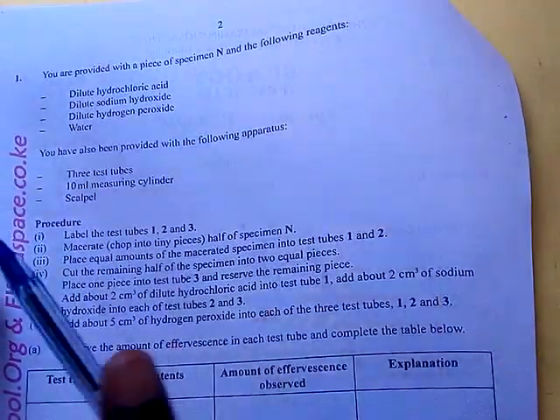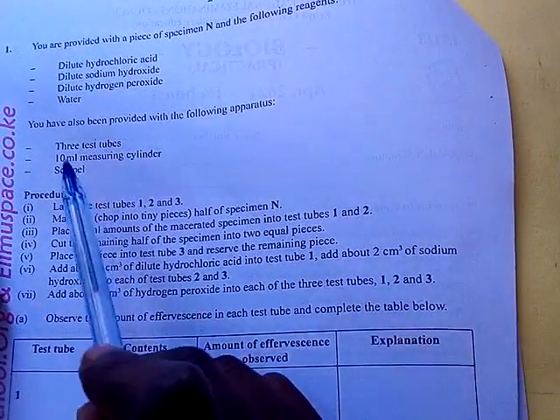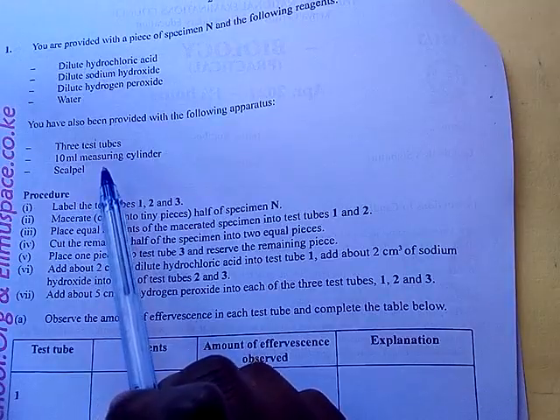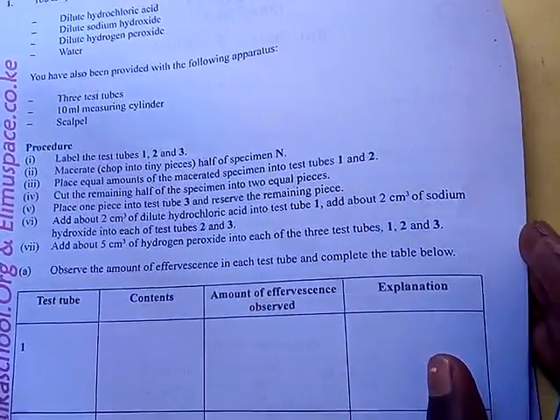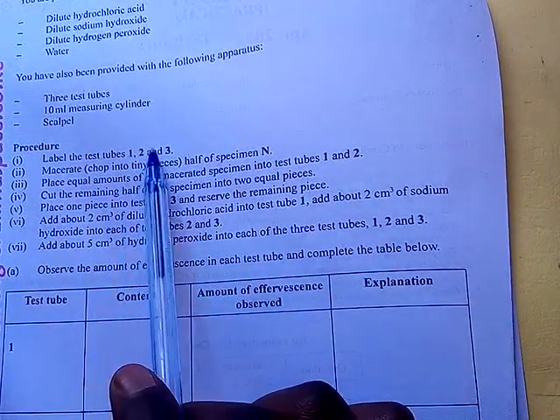You have also been provided with the following apparatus: 3 test tubes, a 10 milliliter measuring cylinder, and a scalpel. Let's see the procedure. Label the test tubes 1, 2, 3.